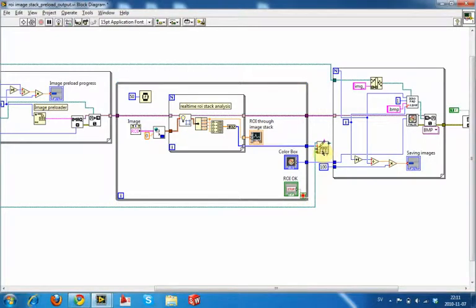This is more of a generic numeric output. It's generally saved as a text file. The options that you get with this are things that you would see as imports into Excel, for example. Like you can choose tab delimited text, you can choose particular characters to separate the text. It's called a spreadsheet because that's generally the option that is imported into most commonly.